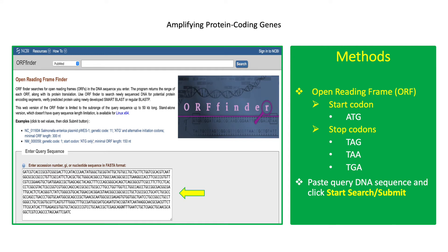Primers are designed to amplify a target DNA sequence, to identify organisms based on a molecular marker, or to amplify a gene of interest with biotechnological applications. To amplify the gene of interest, it is highly recommended to design your own primers based on the nucleotide sequence of the target gene.